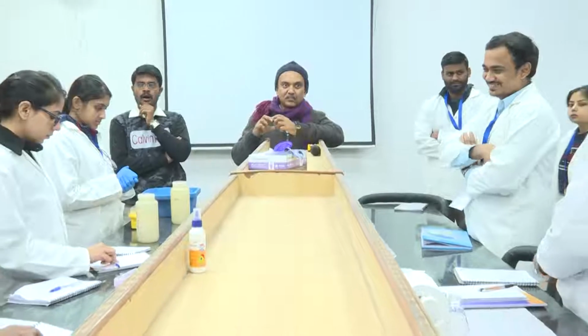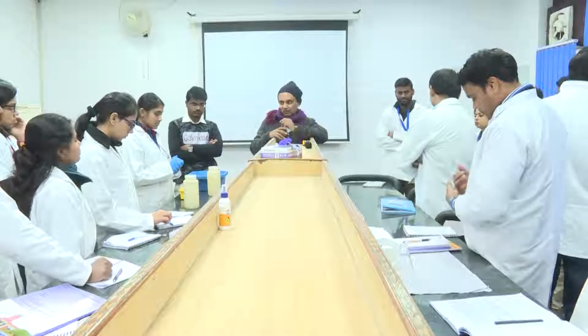This is only to see how pipetting error is going to change your values, because the same DNA, the same primer set, and the same SYBR master mix are given. Then we can see whether our standard deviation values are very low or whether we actually have a problem with pipetting. But otherwise, when you start an experiment, make sure your DNA is of high quality, you are not committing many pipetting errors, and the reaction cups are well set before you take them to the real-time machine.